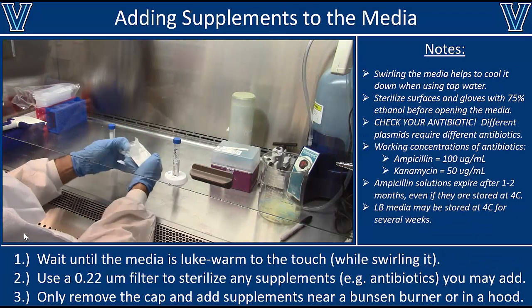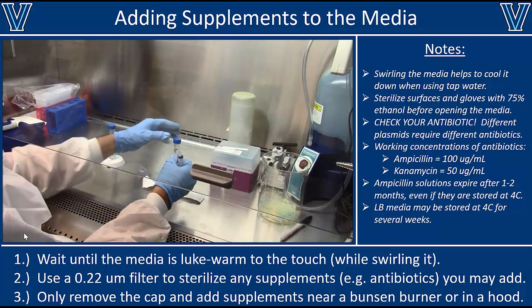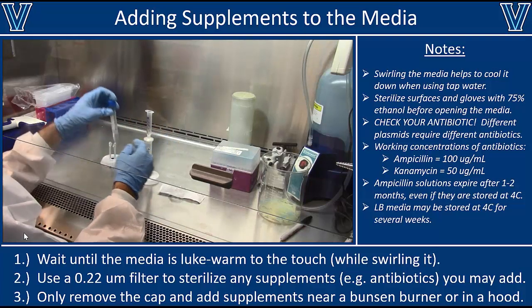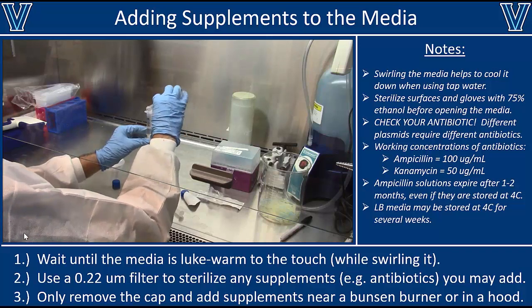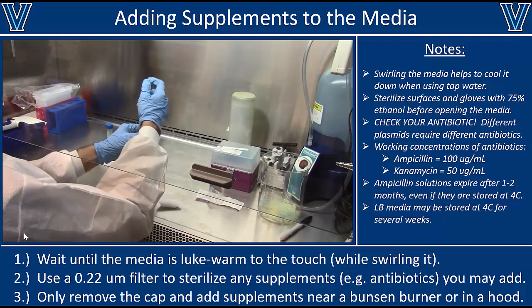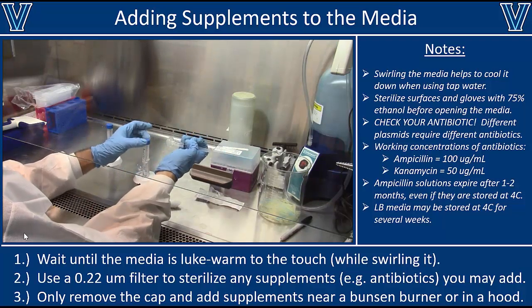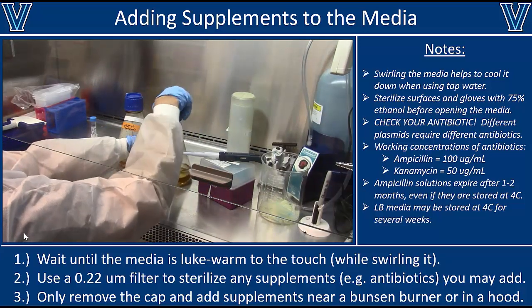Once it's cooled down, add whatever antibiotic you need. If you're growing cells that have a plasmid for antibiotic resistance, such as ampicillin, make your antibiotic stock at the appropriate concentration — for ampicillin we make a 100 mg/ml stock. Before adding it, you want to filter-sterilize it to remove any potential contaminants. Here I'm putting the stock into a syringe and forcing it through a 0.2 micron syringe filter, which retains contaminants but lets the antibiotic and liquid pass through.